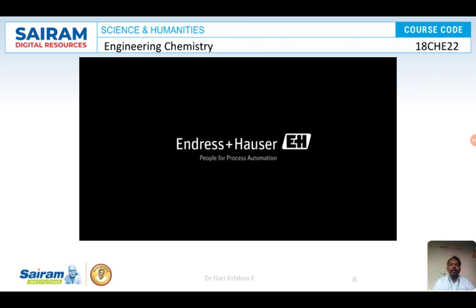Okay. Thank you. In the next discussion, let us see how to determine the pH of a solution using glass electrode. Okay. Thank you.